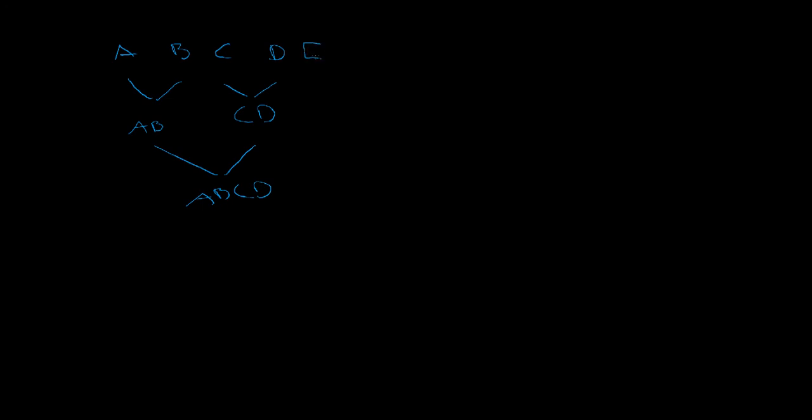We could have E, F, G, and then C1 through C5. This can complicate things, which would make this CD1 through CD5. That's all beside the point, but this is an assembly tree, and there are many ways to do this assembly tree. I'm going to be talking about how we're doing it.